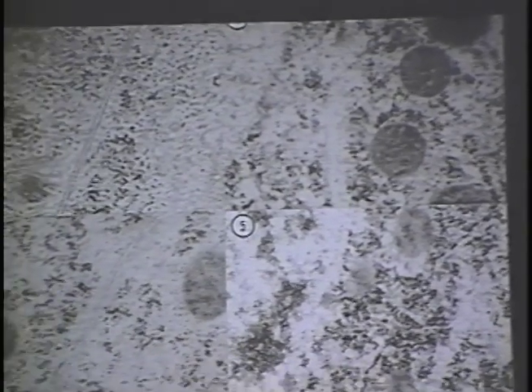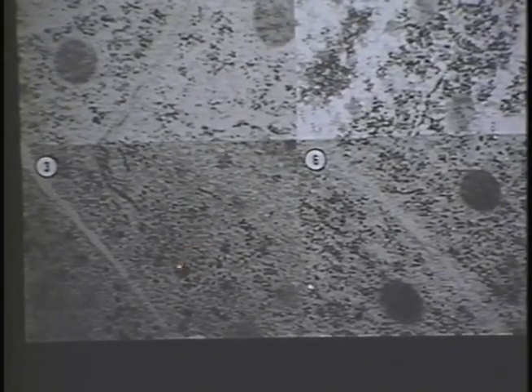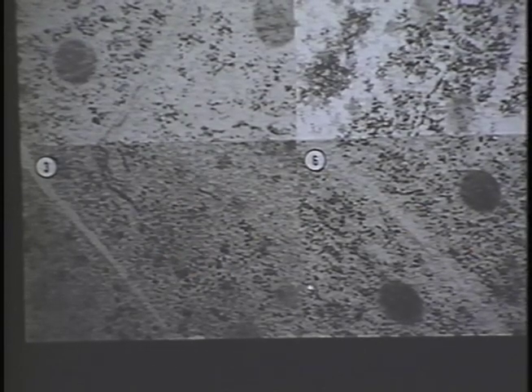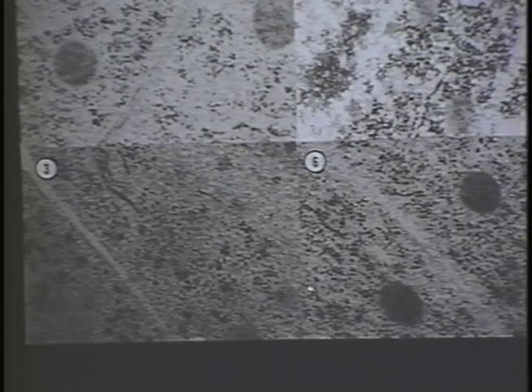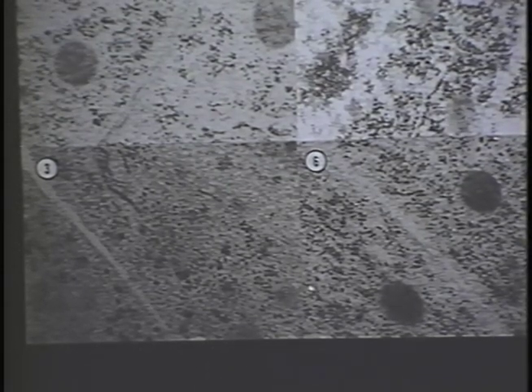The bottom two panels show tissue that was freeze substituted in 0.01% osmium in acetone and embedded in either Epon-Araldite or LR White. These investigators have had success immunolabeling sections embedded in LR White, and even with this low concentration of osmium, the tissue is well contrasted and preserved. Thus, fast freezing methods followed by freeze substitution not only give us the advantage of optimum fixation, but may also preserve sensitive antigenic sites within the cell.